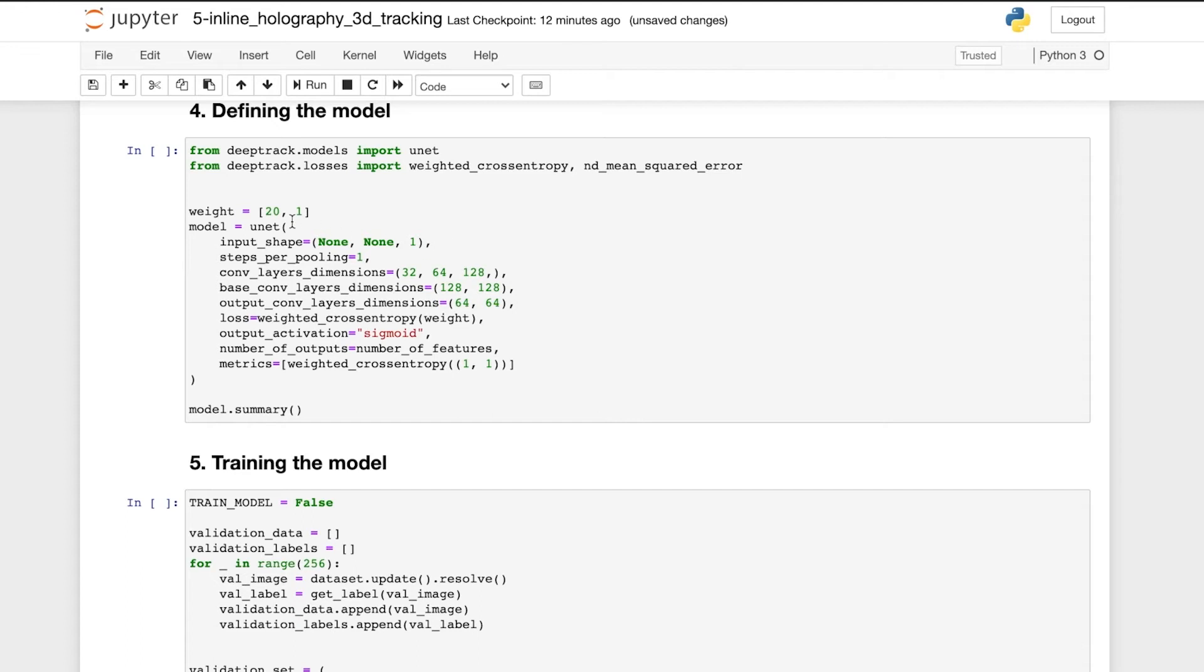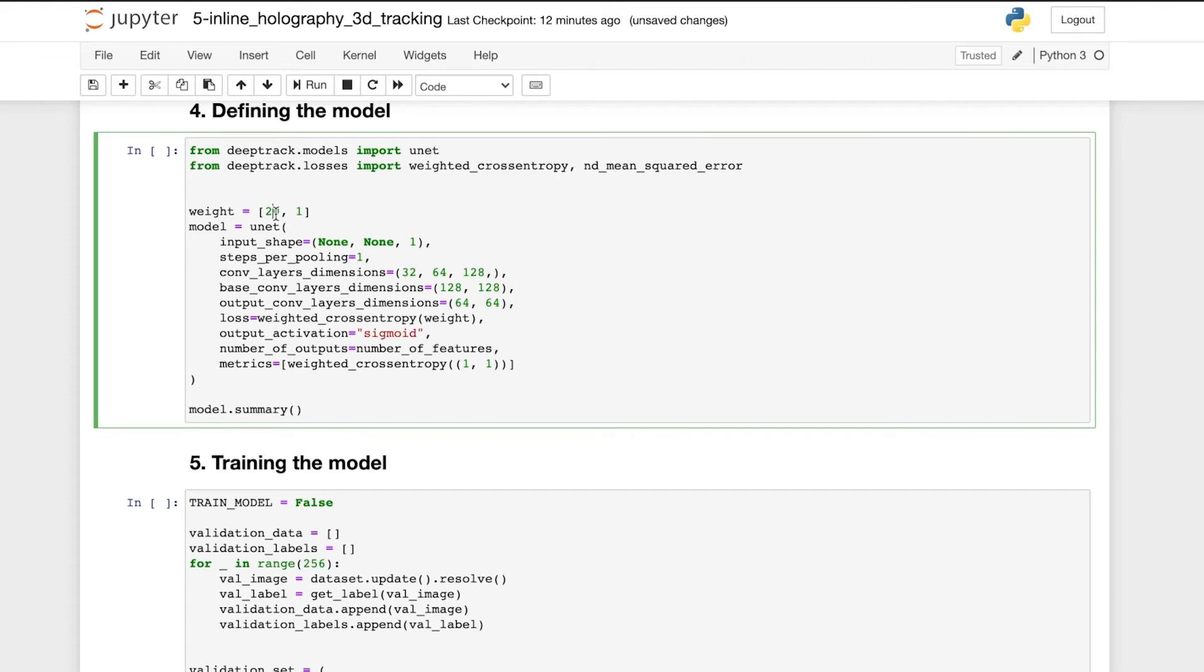The network is compiled with a weighted binary cross entropy loss, such that setting a pixel value of 1 to 0 is penalized 20 times more than setting a value of 0 to 1. This helps the network avoid the very simple local optimum of setting every pixel to 0. And here we see the model summary.